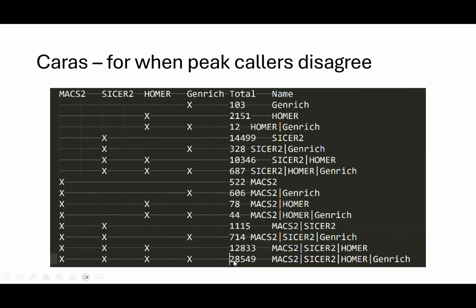They suggest going with that, trusting that peaks found by four separate methods are more likely to be real than the ones picked up by only one or two. I think that's a good way to approach it. Still, each of those has its own parameters, so it can become a lot, but it's a nice thing to try and gives you a little bit of robustness.